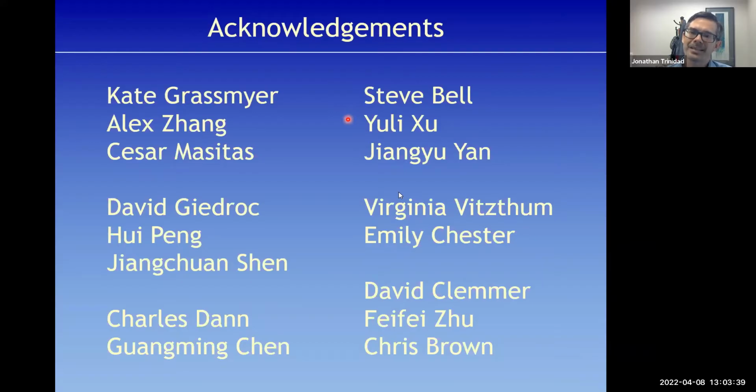I'm only giving you some context for what we've done recently because any lab, us or anyone else, has a certain amount of in-house resident memory. And so I've certainly done a lot more mammalian type cells in the past, but more recently we've done things with more limited proteomes. So we are shooting around the number 1,000 in terms of protein IDs from sample to sample. And we're getting relatively good quantitative reproducibility.